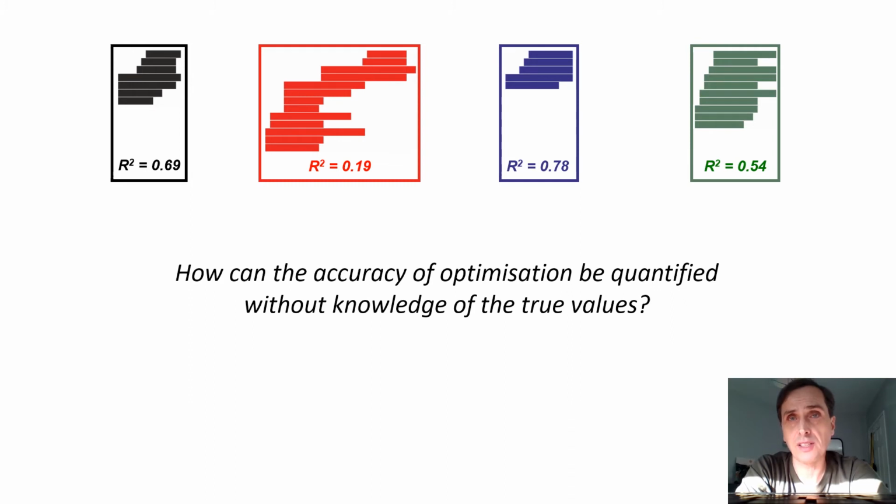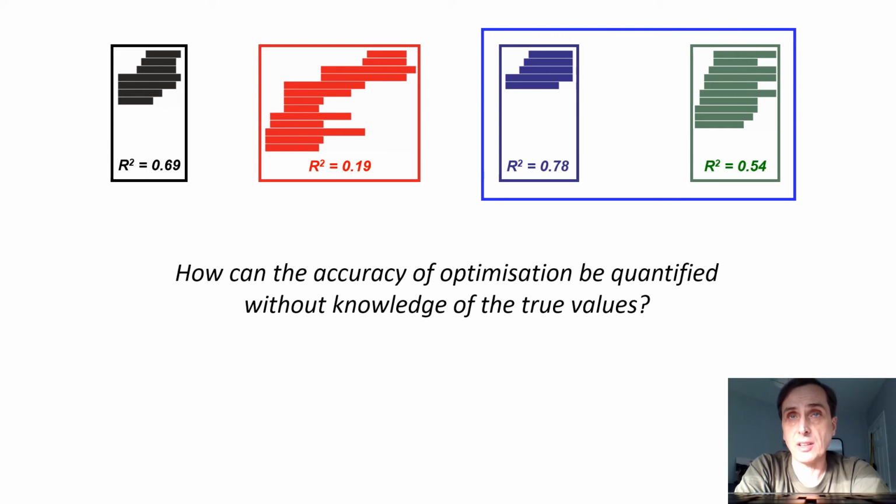Obviously redundancy is often taken as a good indicator of how well a data set is going to optimize, but aside from redundancy having to be above a certain threshold, it's really quite a poor indicator. So you can see that from these two data sets. Obviously the subsection in green has many more peptides and therefore a higher redundancy, and yet the coefficient of determination is much lower than the one that we get from optimization of the blue subsection.